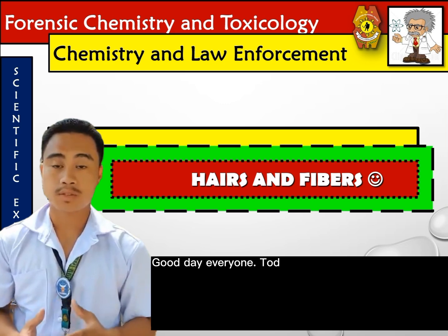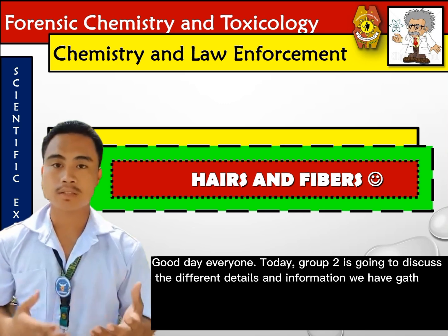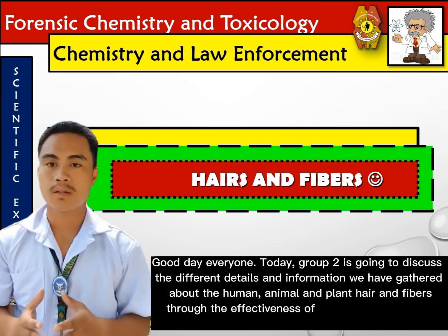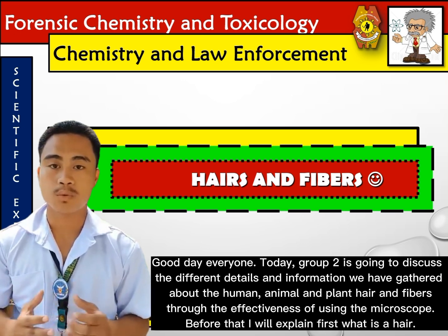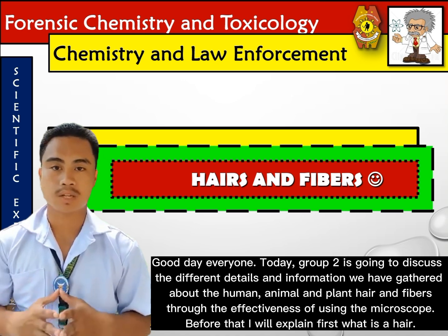Good day everyone. Today, Group 2 is going to discuss the different details and information we have gathered about human hair, animal hair, and plant hair and fibers through the effectiveness of using the microscope. But before that, I will explain first what hair is.